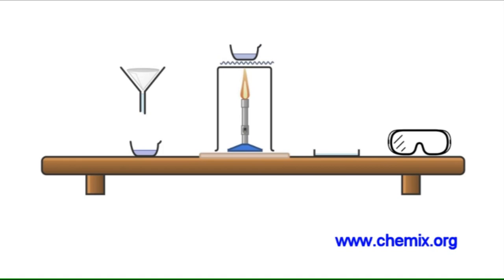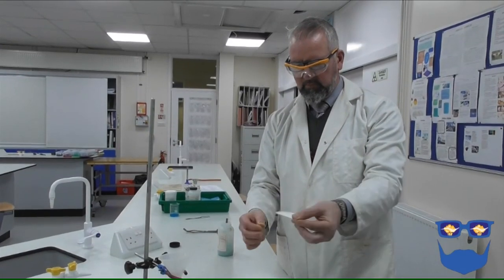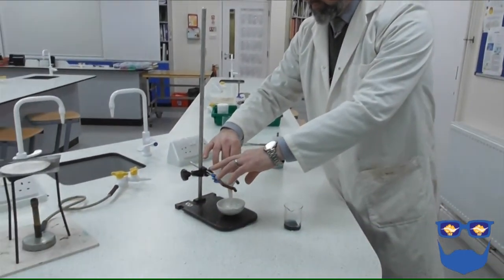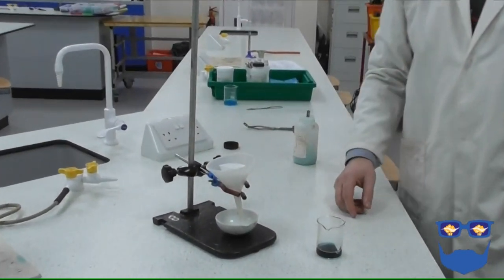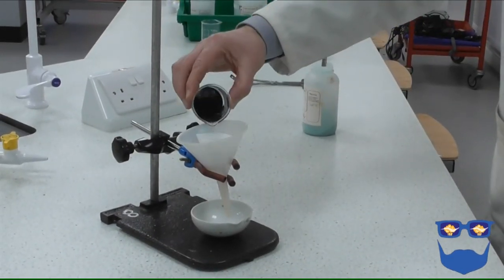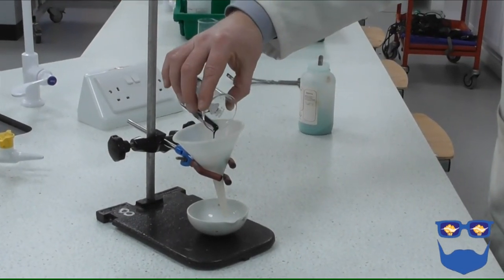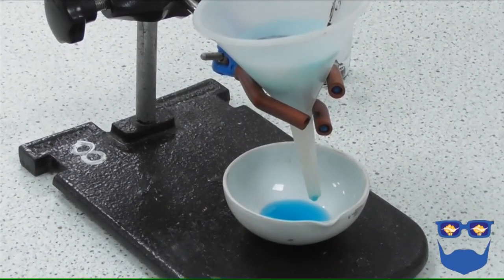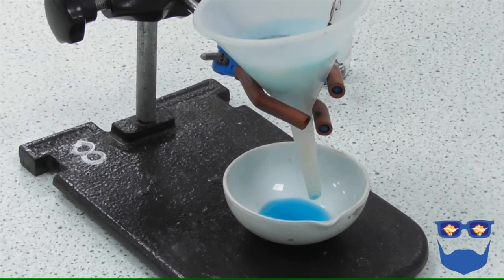Stage two: purifying the sample. Once more you need to be confident with the equipment and procedure. We are going to need a filter funnel, filter paper, evaporating basin, petri dish, and safety glasses. Fold the filter paper into the filter funnel and stand the funnel over the evaporating basin. Pour the mixture of copper sulphate solution and unreacted copper oxide through the filter. We have now separated the solid copper oxide and are left with the copper sulphate solution.